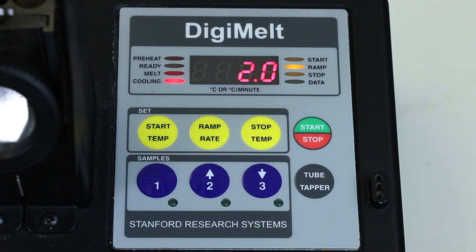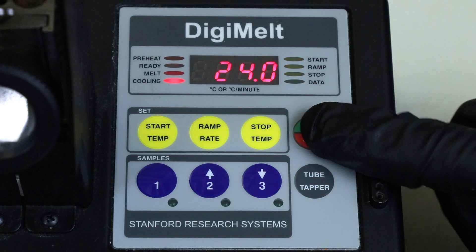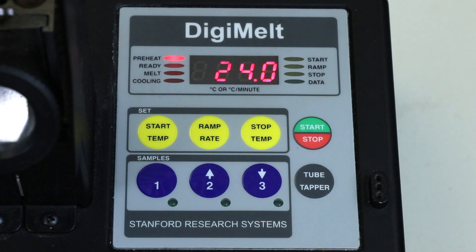Now the apparatus is ready, so press the start button. The light will move to preheat and the apparatus will begin heating the metal block to the start temperature you set. It'll begin to slow down as it approaches the start temperature, and the light will go to ready once it is close.